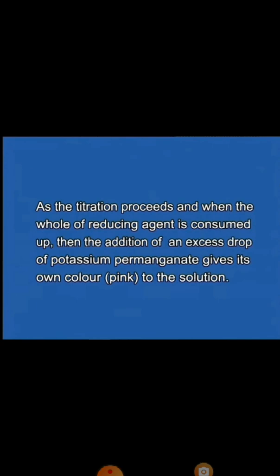As the titration proceeds, and when the whole of the reducing agent is consumed, the addition of an excess drop of potassium permanganate gives its own color, that is pink color, to the solution. Therefore, at the end point, the color changes from colorless to pink.